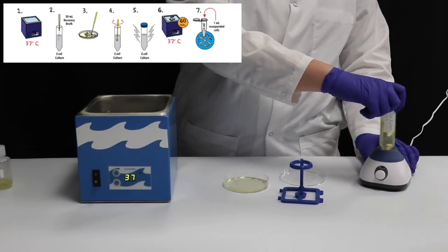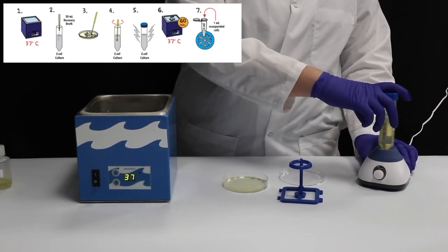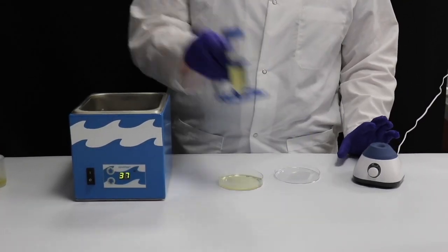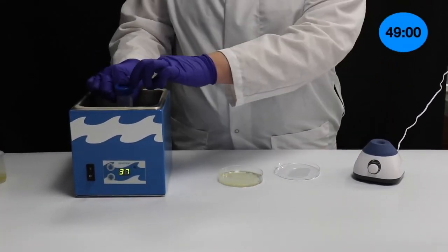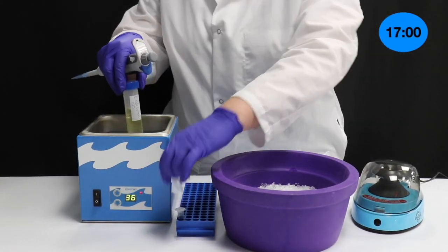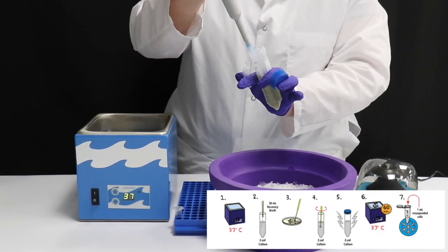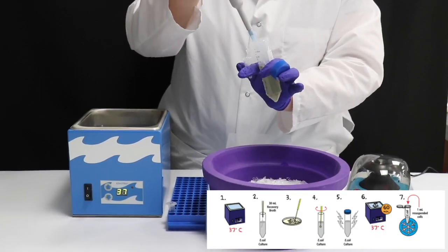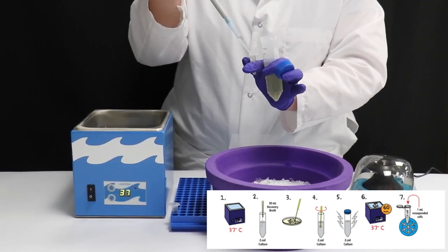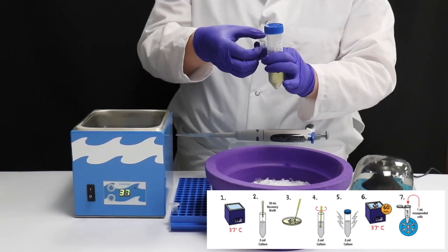If available, vortex the tube to re-suspend the bacteria completely. Place the E. coli Culture into the 37 degrees Celsius water bath for 60 minutes. During the 60-minute incubation, label 1.5 ml microcentrifuge tubes E. coli — you'll need two tubes per student group. After the 60-minute incubation, aliquot 1 ml of the culture into each of the E. coli tubes.